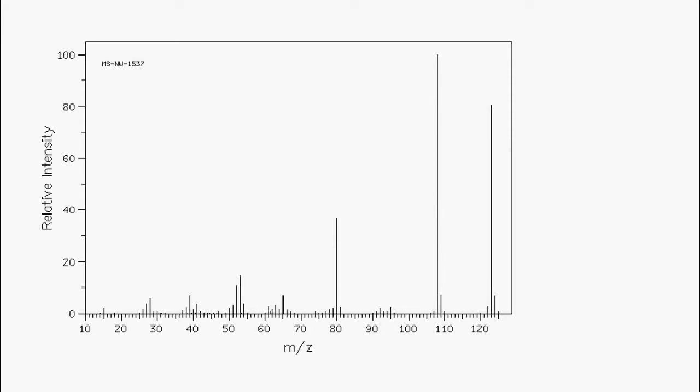So, the most important thing we are concerned with in this is the very first one, which is our M+, or our very first peak, being 123. And this will represent the full molecular mass of your compound. The second part we're concerned with is our base peak, or our most stable ion of our molecule. These two together will give us a decent idea of maybe some functional groups, and it'll allow us to at least get some preemptive structures or theories that we might prove to be the actual structure.